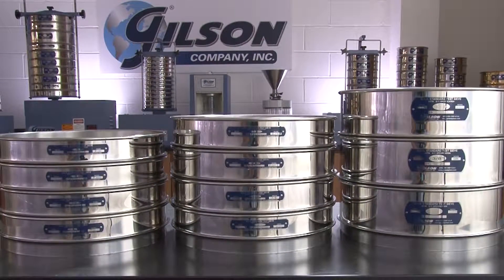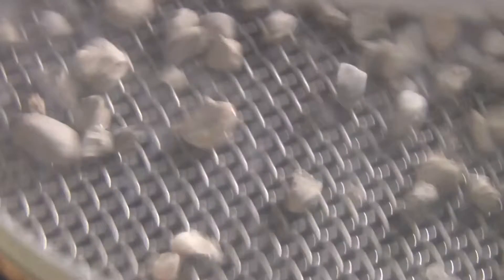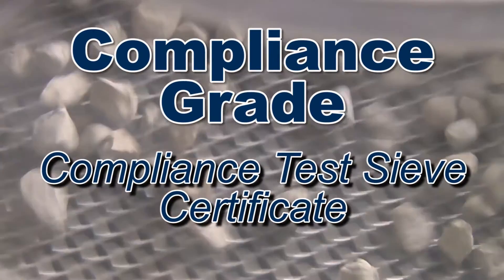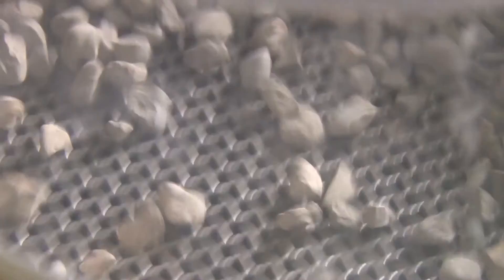Gilson sieves are available in all sizes and types and come in three categories: compliance, inspection, and calibration grades. Compliance grade sieves are supplied with a basic certificate of manufacturer's conformity to ensure that your test sieve was manufactured in compliance with ASTM or ISO standards.